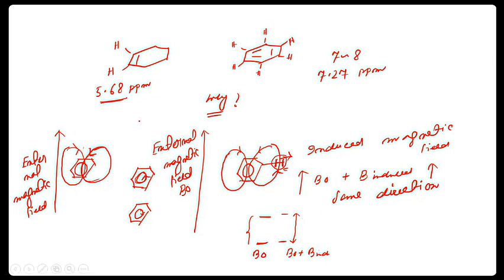So it will shift from 5 to 7. As a result, the protons shift from 5 ppm to around 7 to 8 ppm.